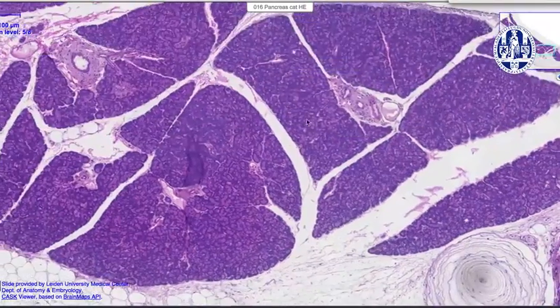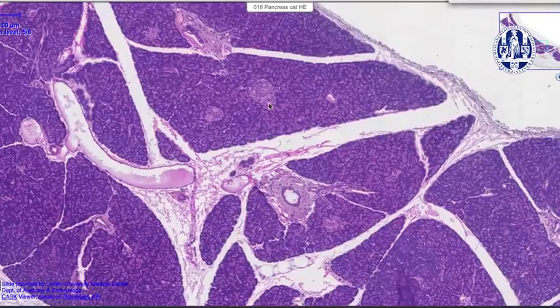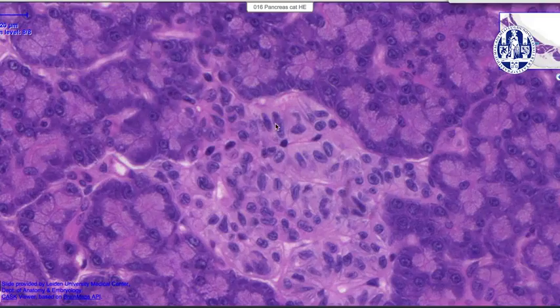Now we're looking for a nice example of an island of Langerhans. Here I have one. It has no ducts, of course, and no enzyme granules. Specialized alpha and beta cells produce and excrete hormones like glucagon and insulin directly into the blood capillaries. And you can see some blood capillaries here in the periphery. In light microscopy, you cannot easily discriminate between these special cells.